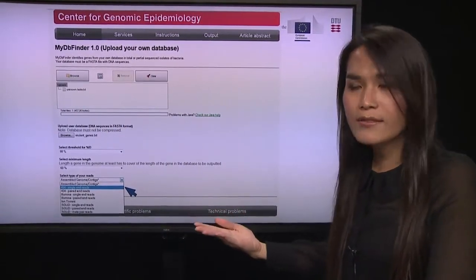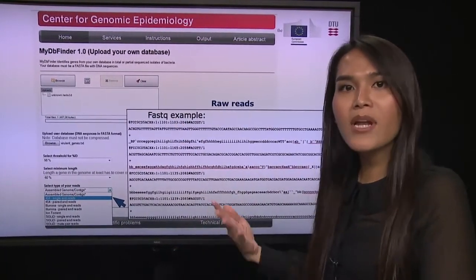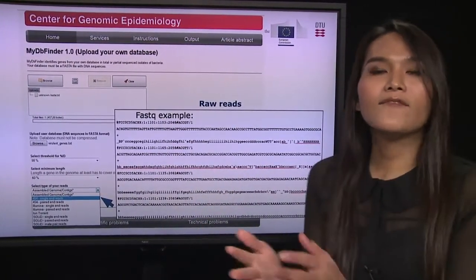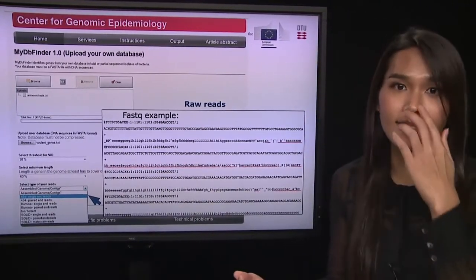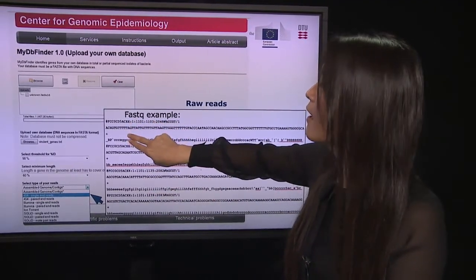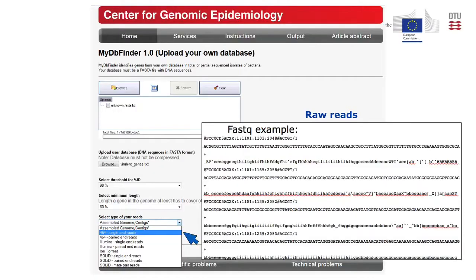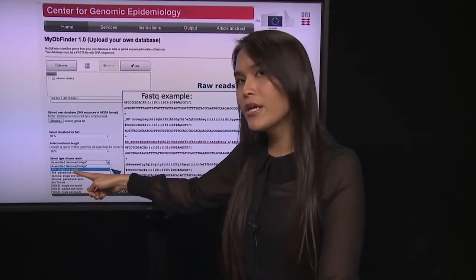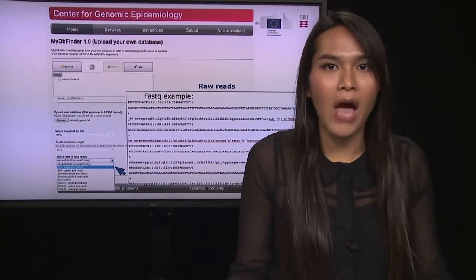The last option is the type of reads you are uploading. If your data is an assembled genome, click 'Assembled Genome' — it must be in FASTA format. If your unknown genome is raw reads, it must be in FASTQ format. FASTQ is similar to FASTA — it is FASTA plus a quality score. The first two lines are the sequencing data and the last two lines are the quality score. You also choose whether your raw reads are single-end or paired-end and which sequencing platform you used.